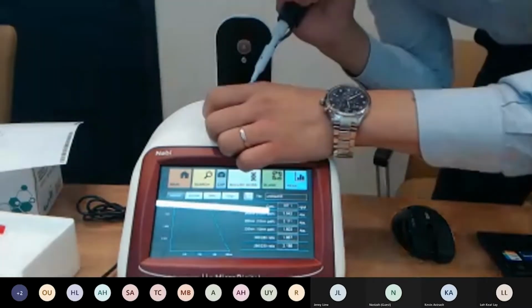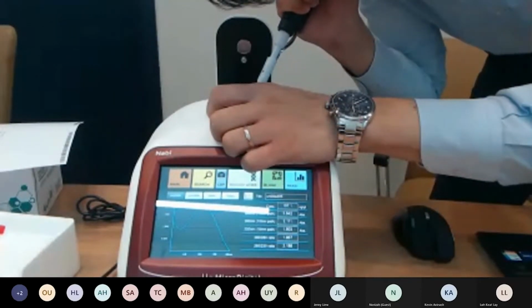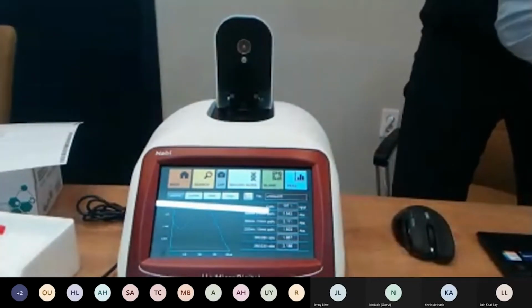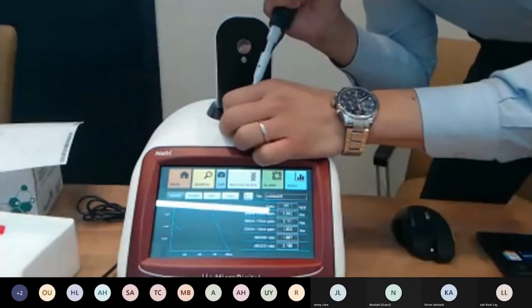The pipetting is a little bit difficult if you're not a skilled technician, which unfortunately I am not. But I do practice for demonstrations, but it's been a while, so please bear with me.